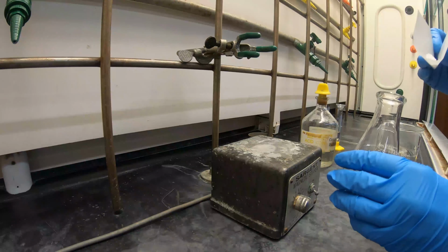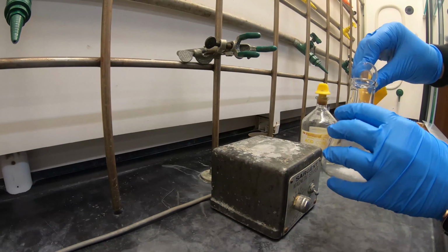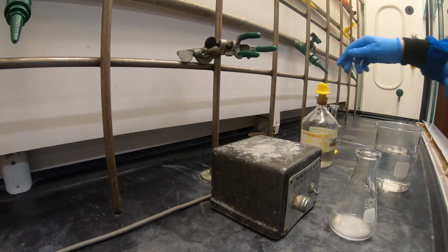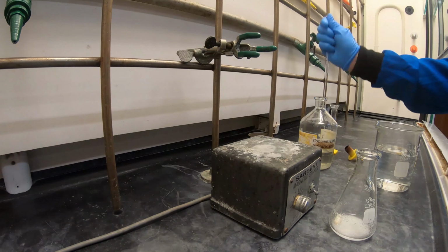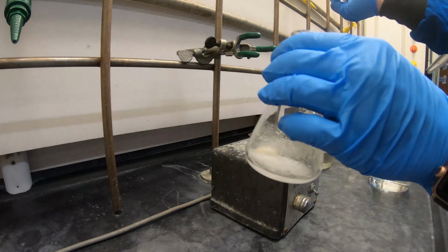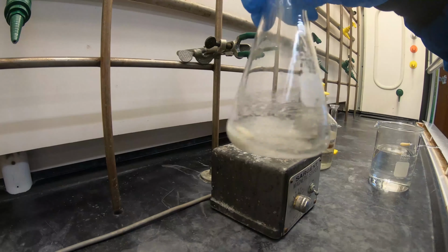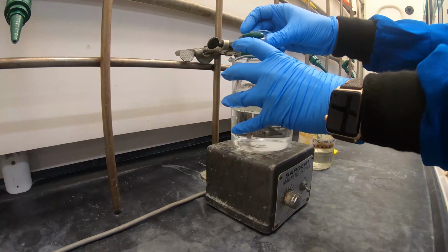Experiment 1. Aspirin synthesis. Begin by adding 15 millimoles of your salicylic acid to your Erlenmeyer flask. Follow this with an addition of 5 ml of your acetic anhydride and then 3 to 4 drops of your concentrated sulfuric acid via pipette. Swirl the flask and then place in a hot water bath between 45 and 50 degrees Celsius.